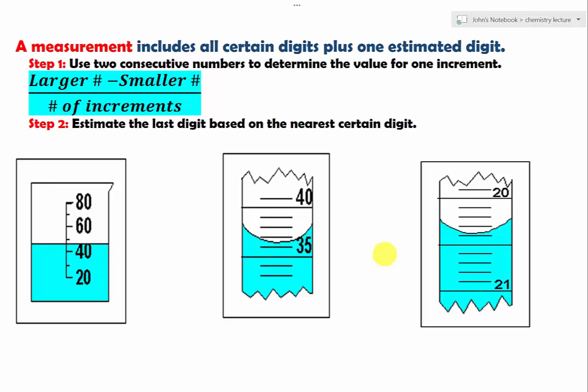In this lesson, we are going to learn how to read measurements so that a measurement includes all the certain digits that we can prove based on the instrument.